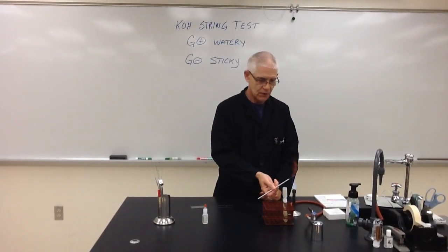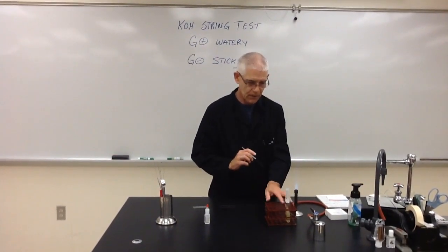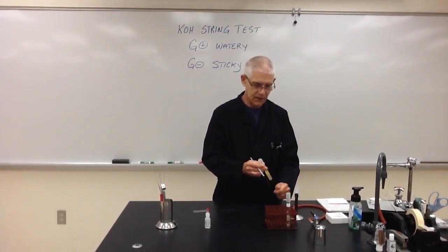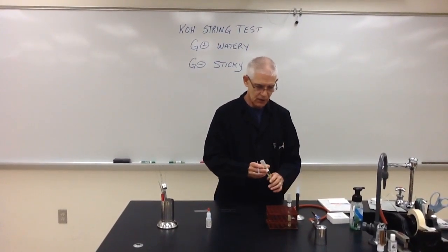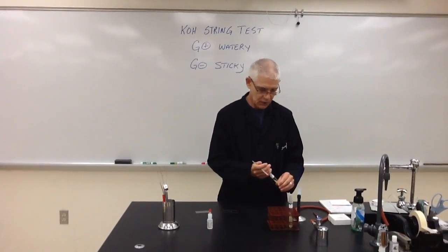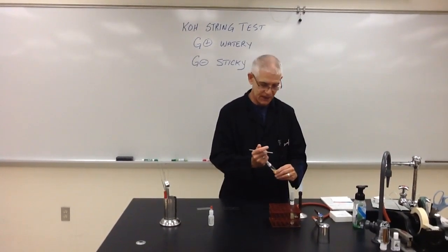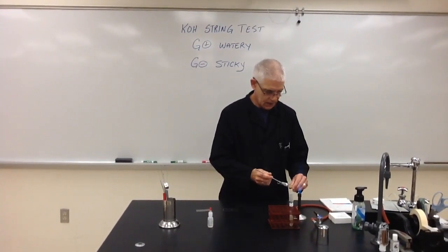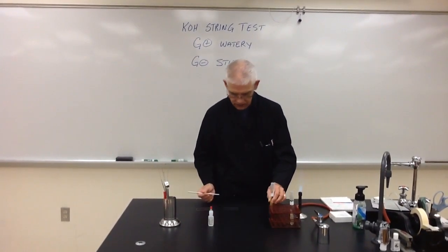So make sure you do a good job keep flaming your loop, as always. Let that cool a little bit. And our gram-positive today is Micrococcus luteus, and it's got a nice yellowy color to it. So for this particular experiment, this is one you really need to have a lot of bacteria. Normally I tell you don't have to have a lot, but in this case you want to make sure you have enough.